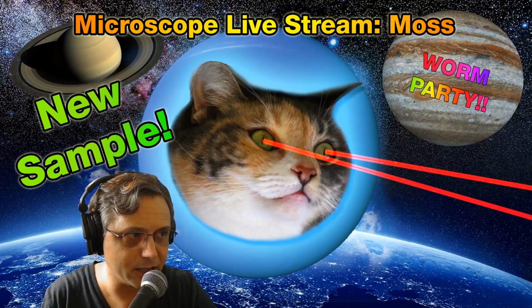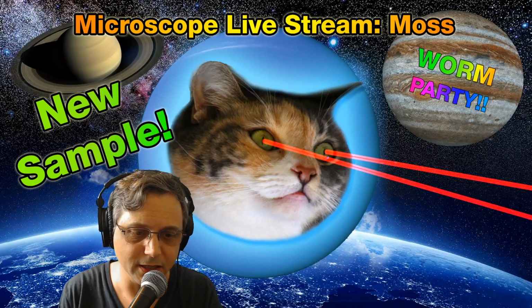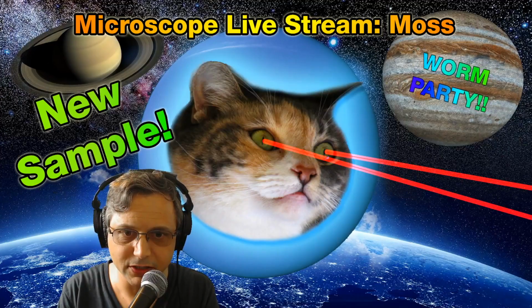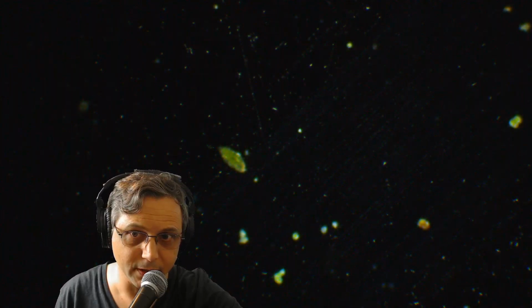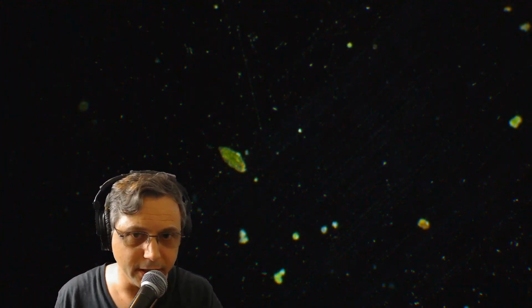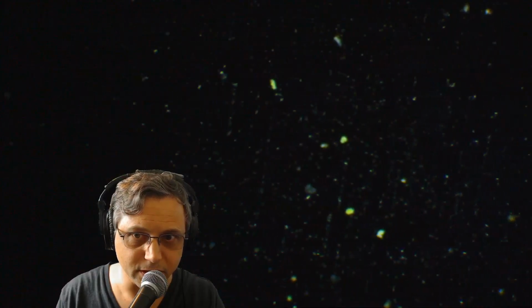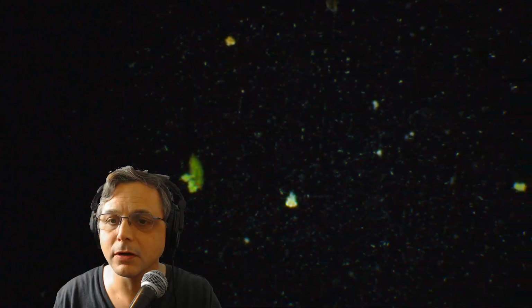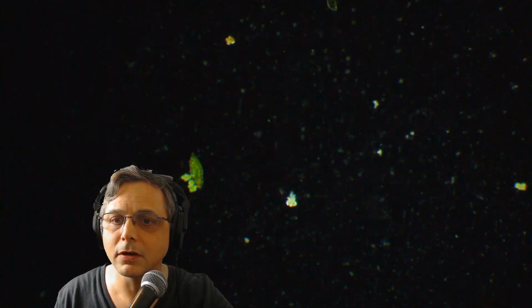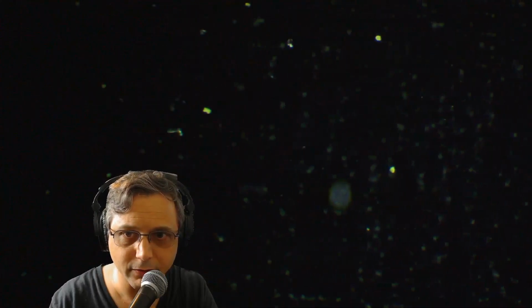So I got it all dialed up here. We're on the first objective. We're just going to go in here and see what we see. Gotta focus. And again, we're on the first objective. And this is a brand new slide with a brand new cover slip. And I just want to see if we find maybe some rotifers in here. If not, we can always try again.